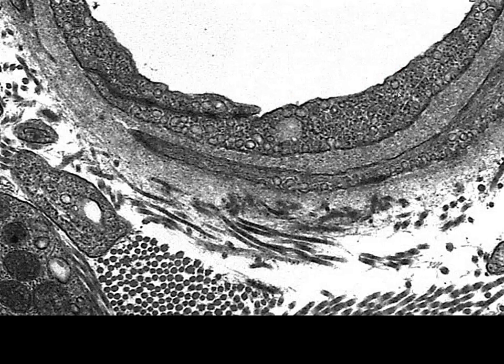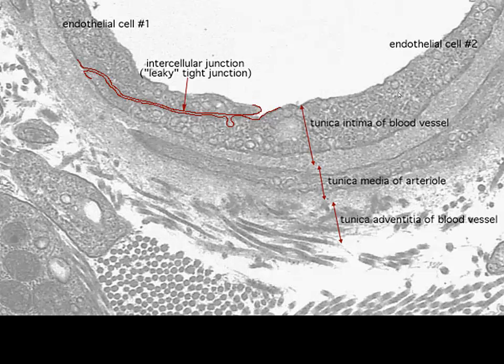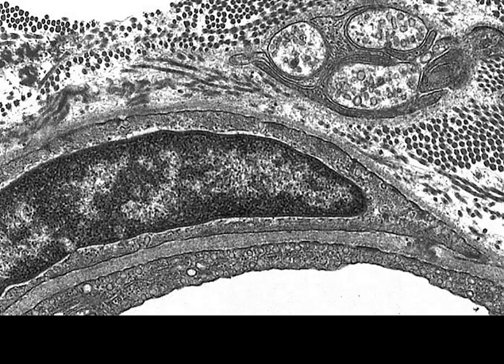Again, just more images of that same field that we were looking at, at a little bit lower magnification. We can see collagen fibers in cross-section, and longitudinal section near the bottom. There's our nuclei, and possibly a little nerve bundle up at the top, an unmyelinated nerve bundle.